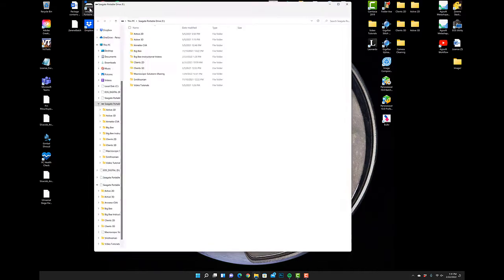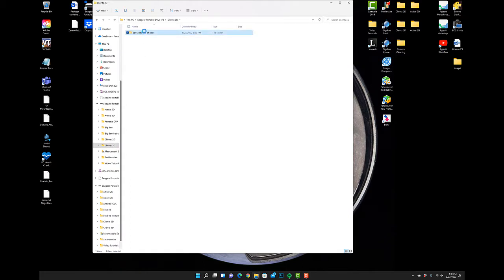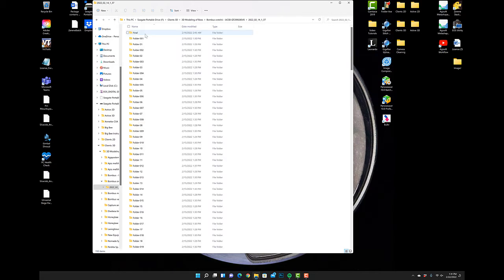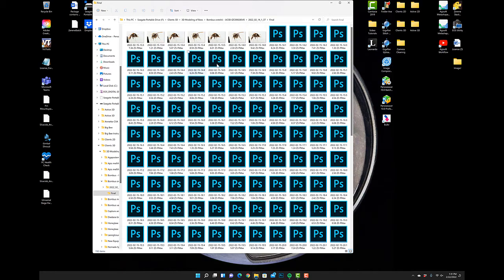So first thing we're going to do is navigate to the output folder where we have been saving our output images. So we're going to navigate to the specimen that we've been using for demo purposes. That's this one here, ending in 545. Okay, so these are all the individual folders that we put together for individual focus stacks. And this is the final output image where all those final images have been stored.